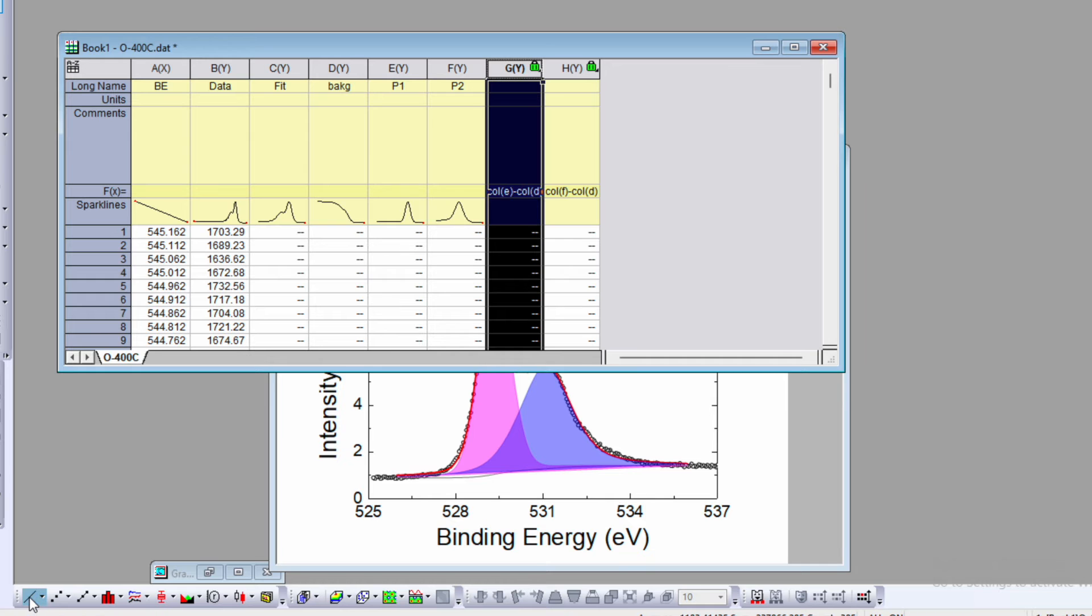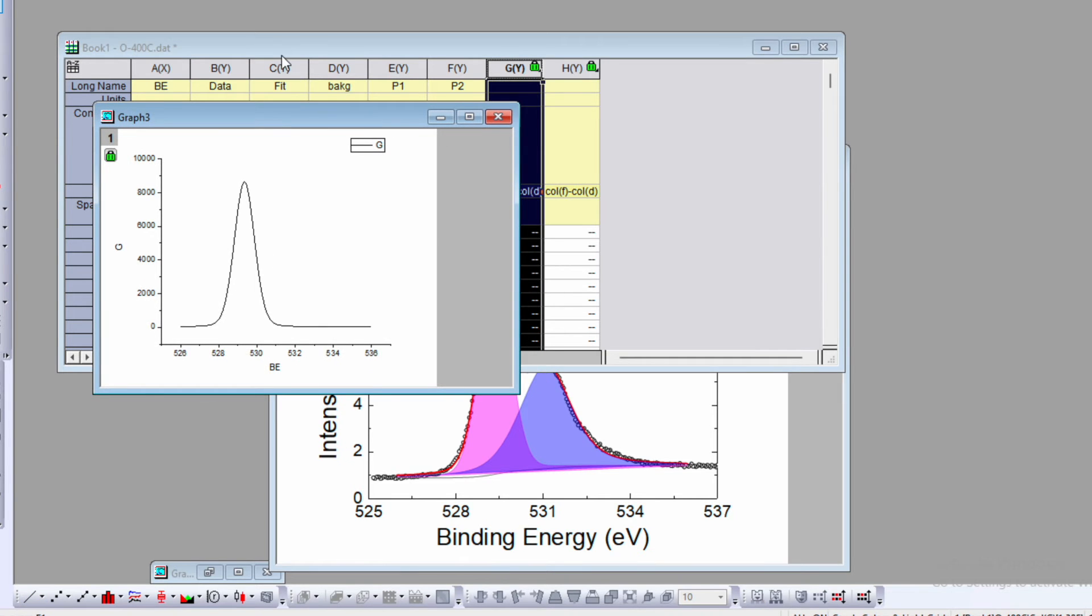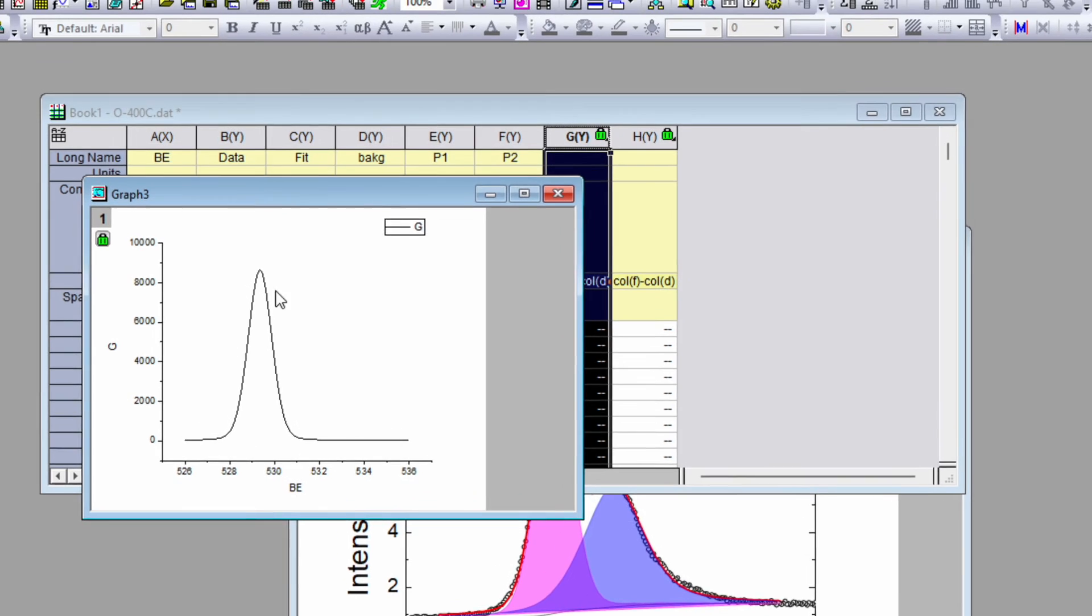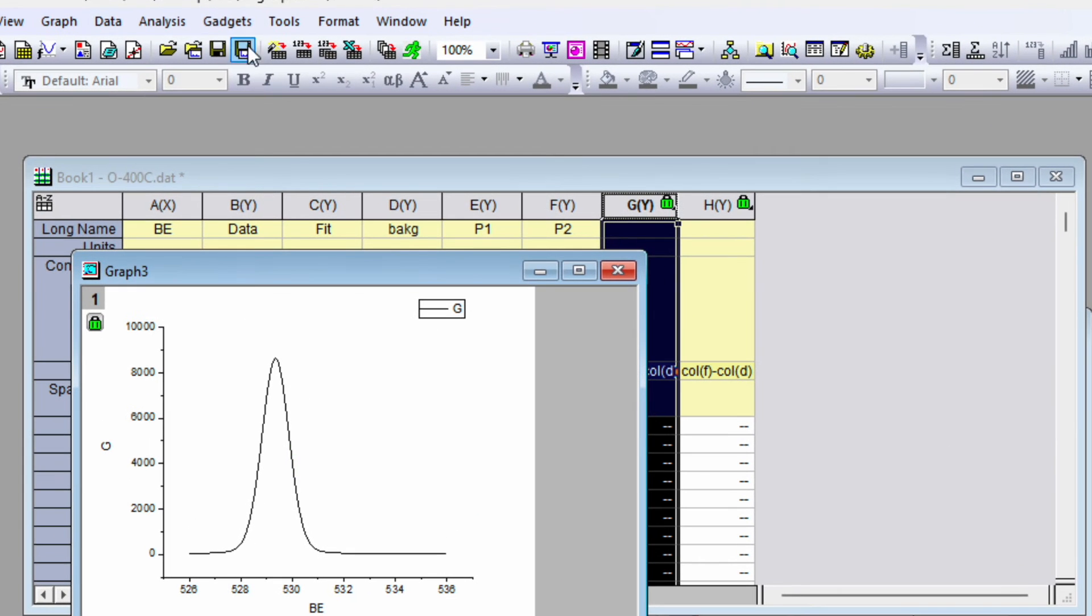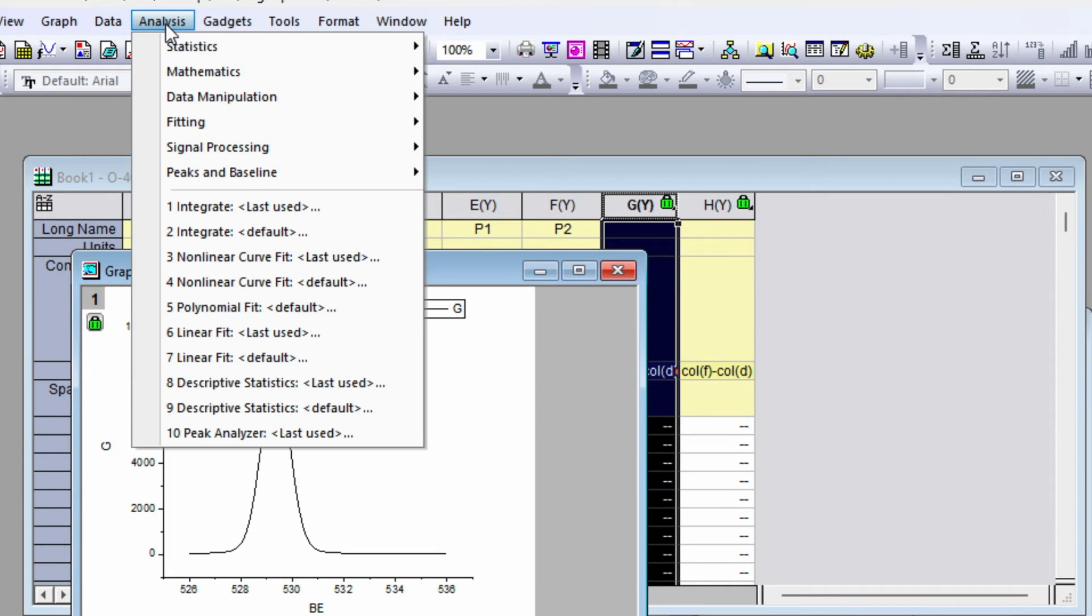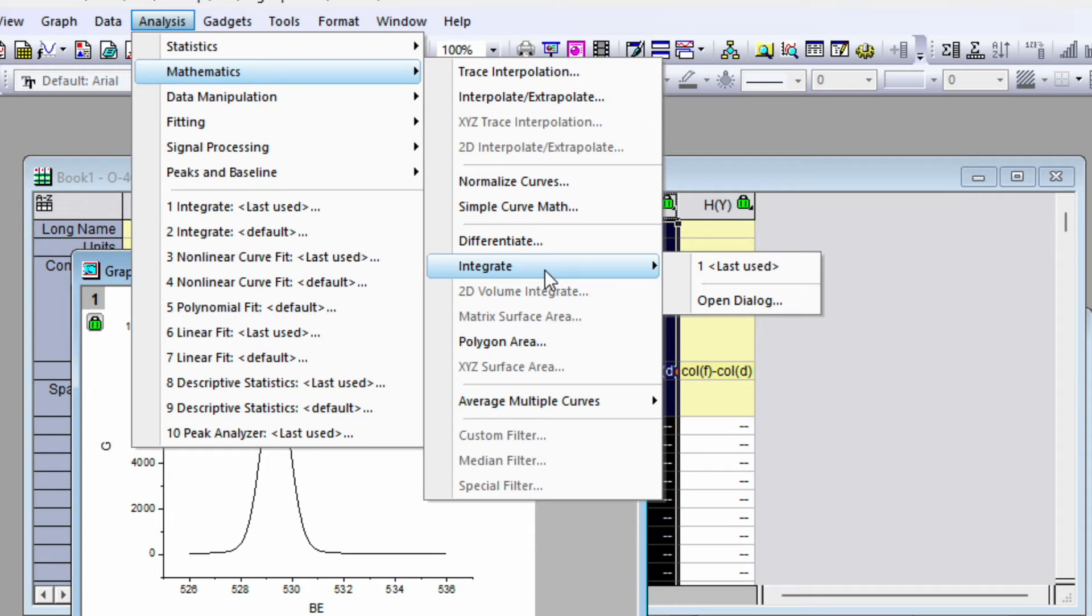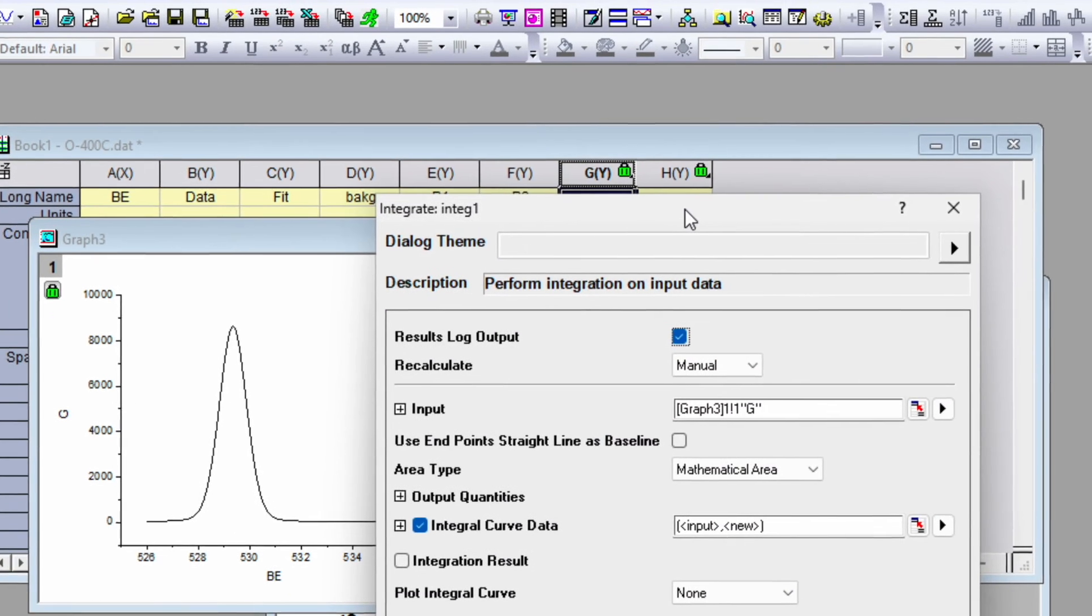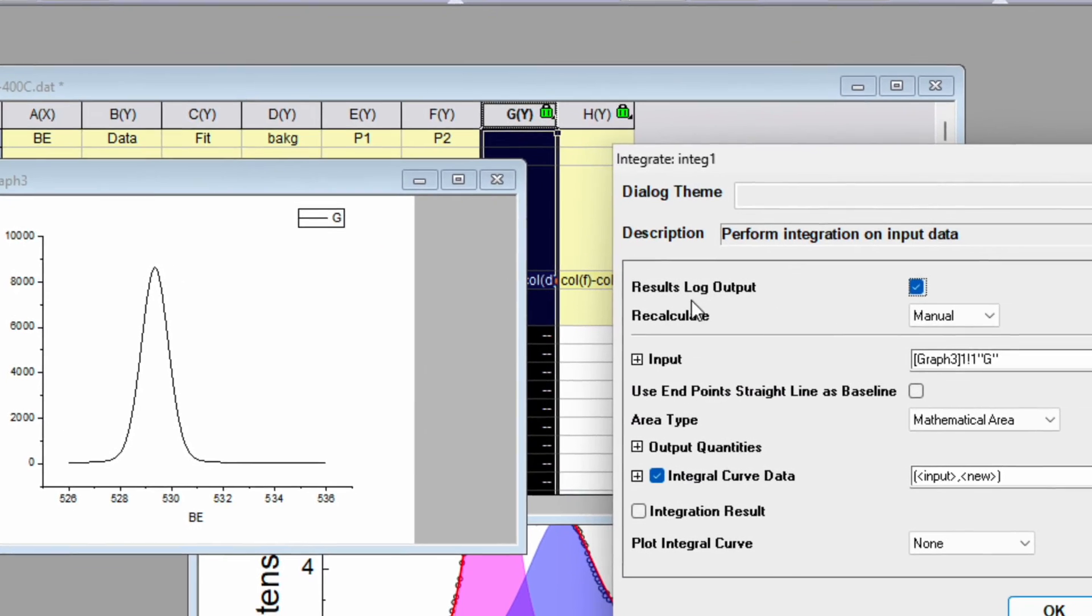Now if you want to get the integrated area or area of this peak, go to Analysis, then go to Mathematics. In Mathematics you can find the option for Integrate. Click on Open Dialogue.